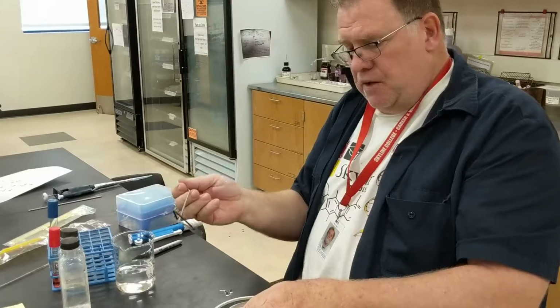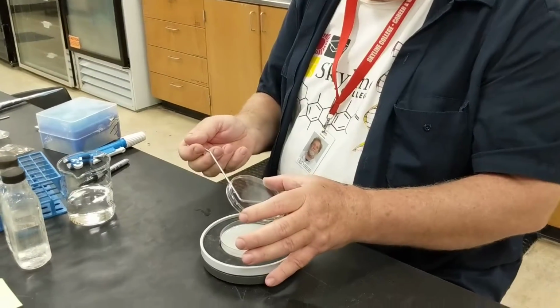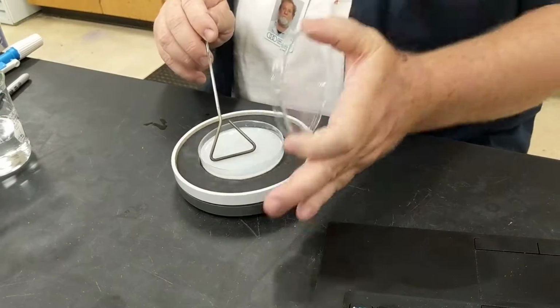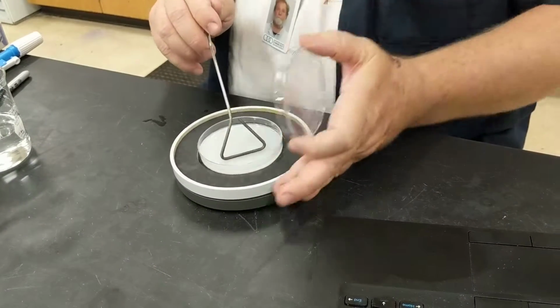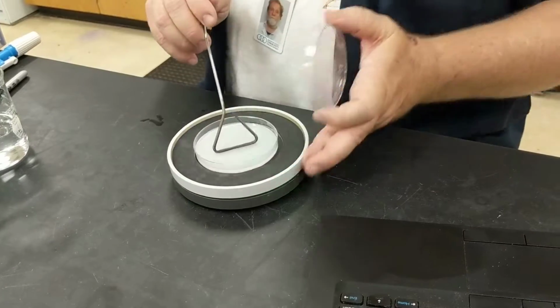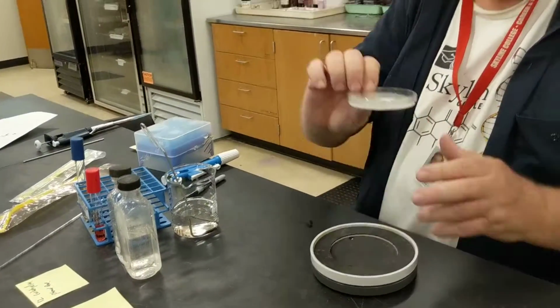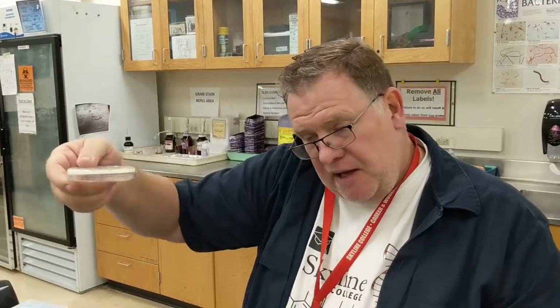Then I can touch either the top of the plate or the side, and I will use the turntable and just spread it, moving the bacteria evenly on the plate. When you're done, the spreader will go back in the alcohol, and that will kill the bacteria. You're going to let these plates dry for about 5 minutes. Then you can invert the plate and safely put it in the incubator. Okay? That was Chapter 9, looking at our dilutions and spreading. This is Nick Cap, and that was your Microbial Lab Minute.